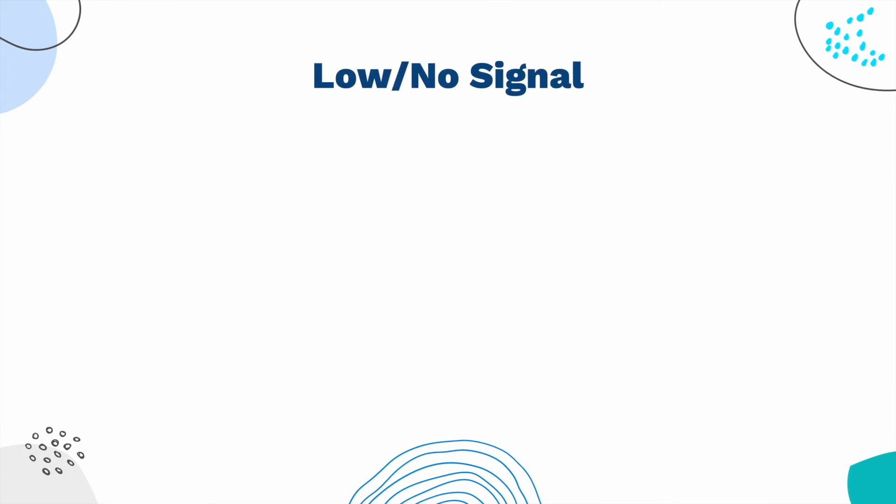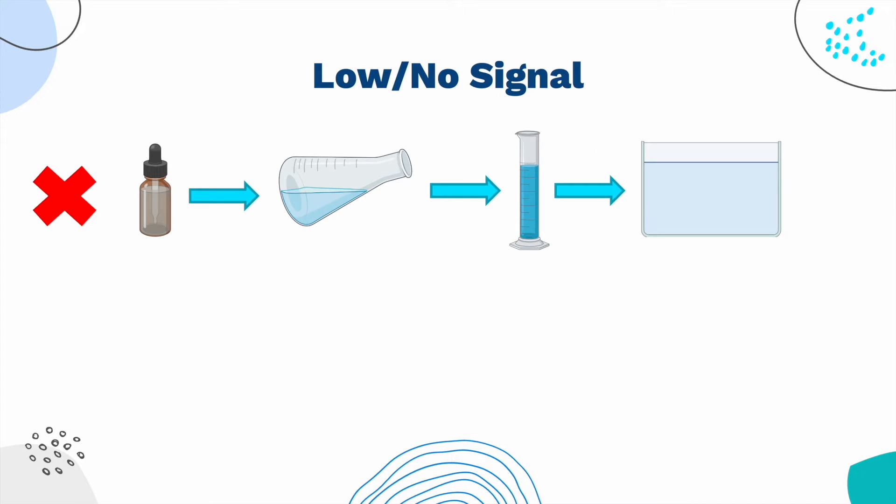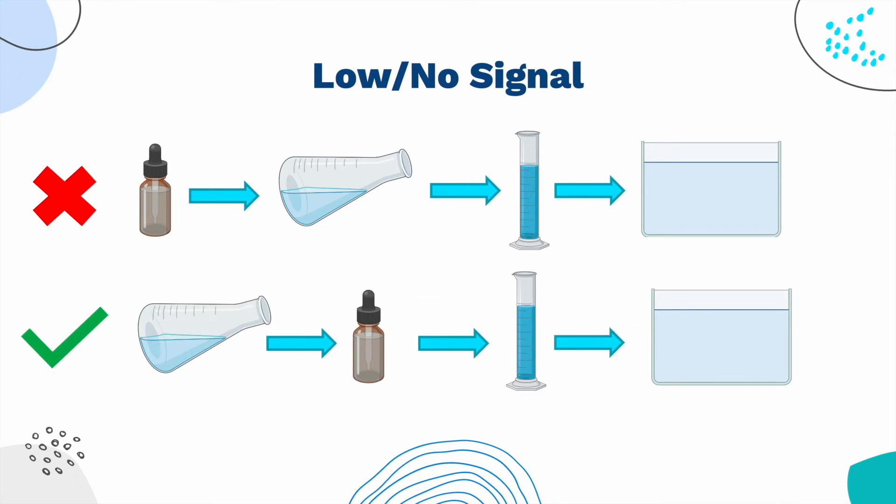If you see your ELISA has no or low signal, your reagents may have been added in an incorrect order or incorrectly prepared. Repeat the experiment and make sure to closely follow the provided protocol and solution preparation for whatever kit you may be using to conduct your ELISA.